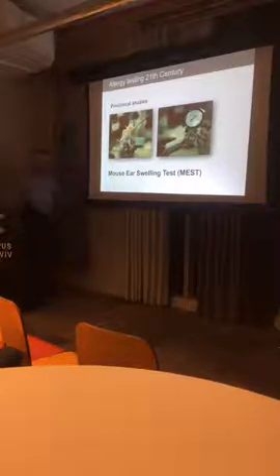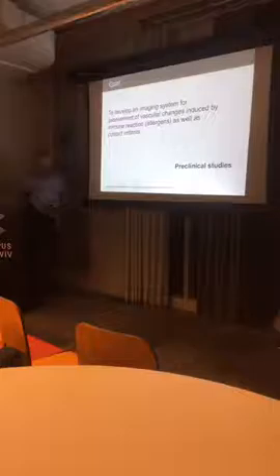More than that, we don't have a good tool for animals. Modern medicine and modern biological studies use animals, and in order to test the allergic reaction in animals, with the state-of-the-art technique they measure the swelling of the mouse ear. This test is called the mouse ear swelling test, and our goal was to develop a technique that could solve this problem.